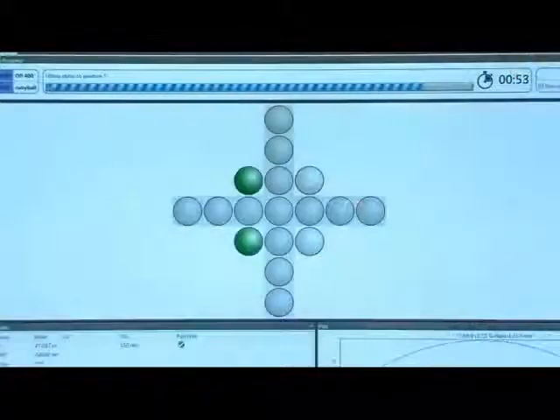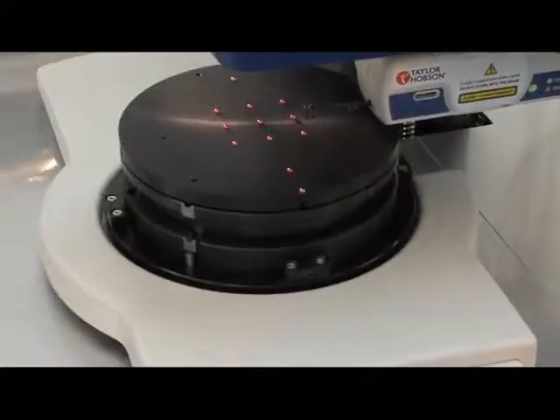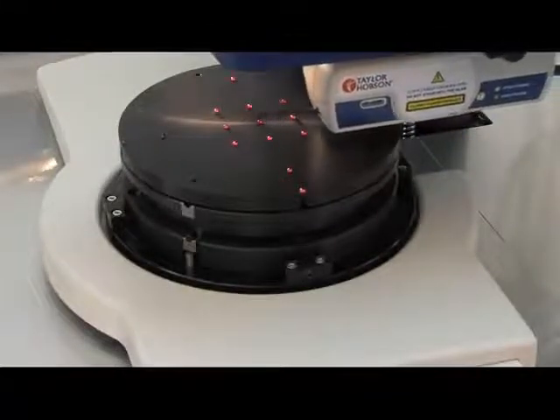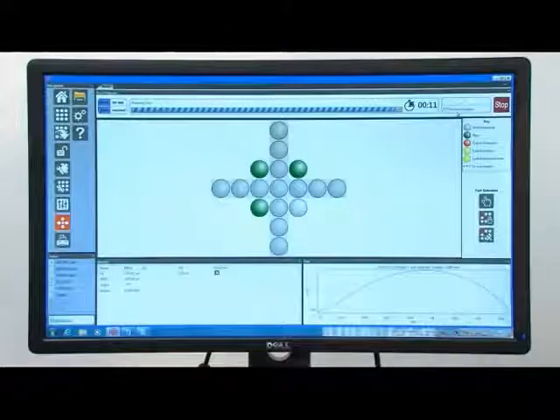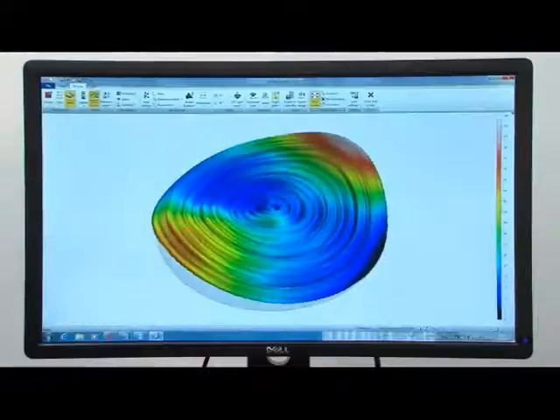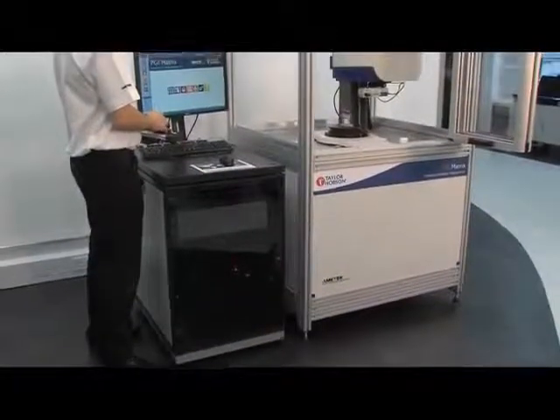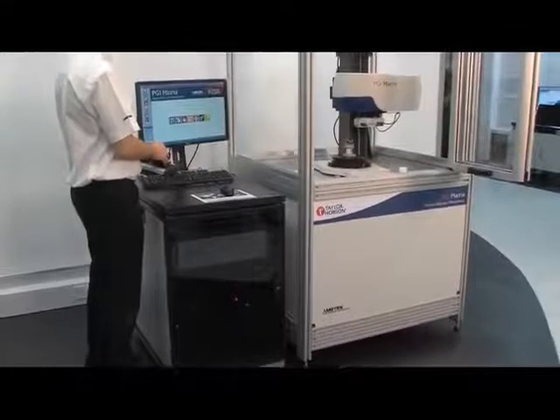The TallySurf PGI Matrix, a fully automated one-touch optics measurement system. It will increase your productivity, has an easy to use interface. TallyMap analysis software is equally at home with single or multiple parts. It's fast and accurate.